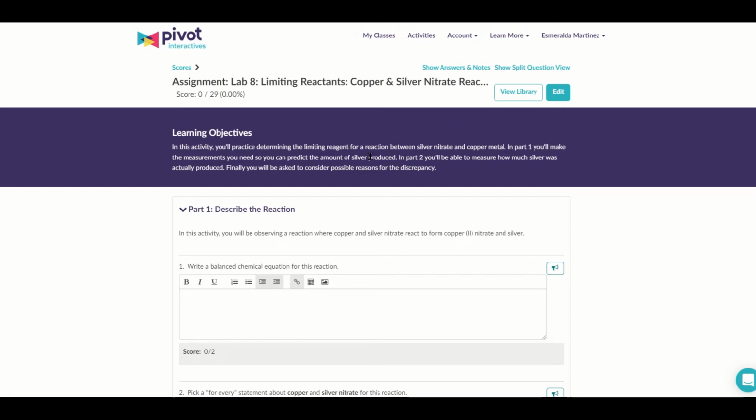Hi everyone, in this video we will be discussing this lab on limiting reactants. Specifically, we are working with a copper and silver nitrate reaction. So we are reacting silver nitrate, which is an ionic compound, and you can tell that based off of having silver, which is a metal, and nitrate, which is a polyatomic ion, which is all nonmetals. So that's an ionic compound, and then you have copper metal reacting.